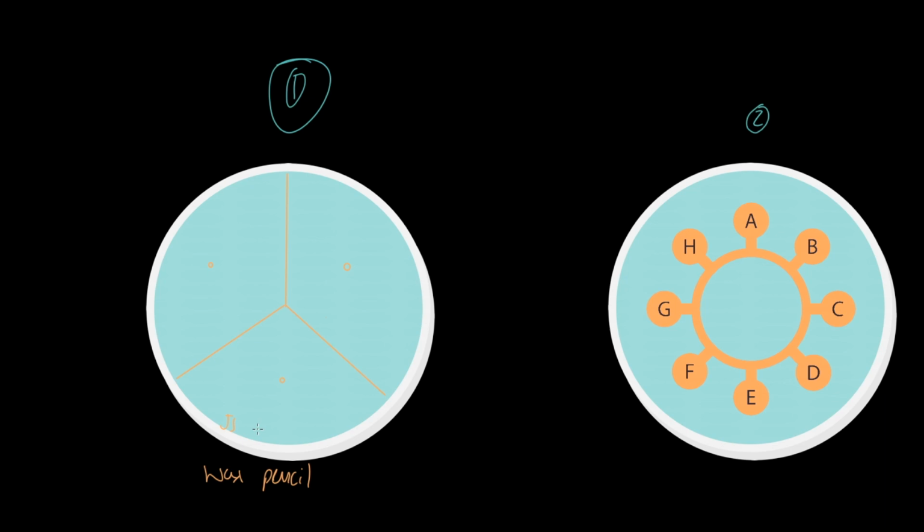So for me it would be JS, and we're going to write on here, I'll put the date on for me right now. Today it's 15th of the 1st '19. I wonder if that's going to be an interesting date because the Brexit vote is this afternoon. I don't know what's going to happen, but there you go. And we're going to write on here that this is E. coli.